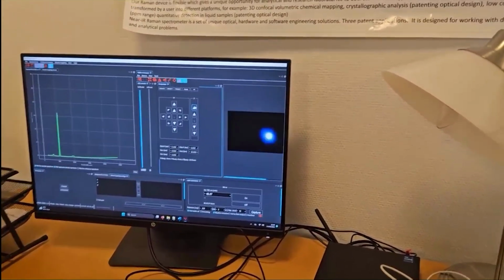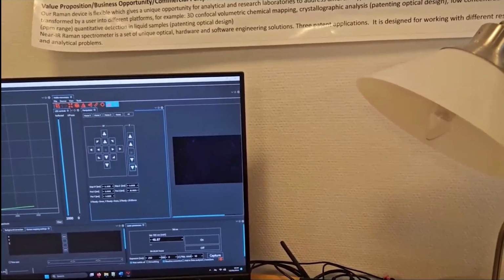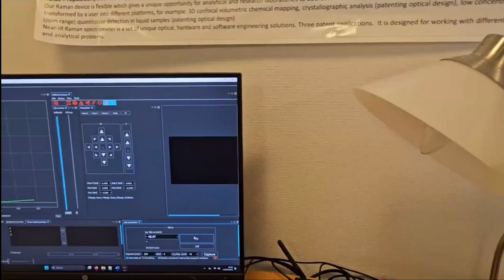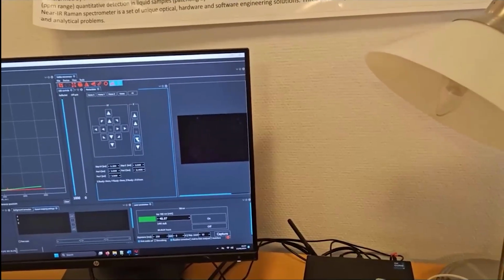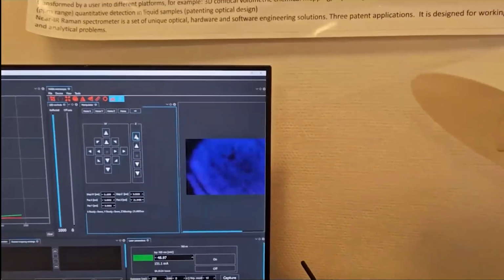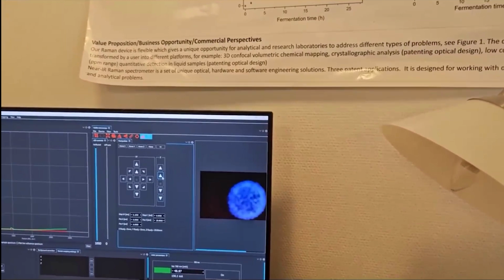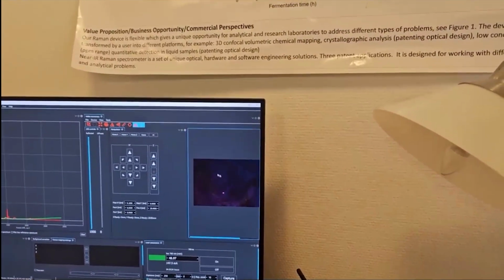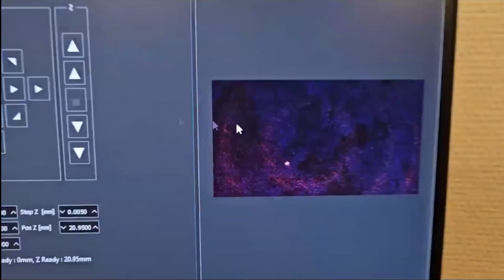Okay, now we have some light and the surface. The sample is transparent in this way. You see a dark image, not so much reflection from it. But let's see the laser spot. Well, the laser spot now is not in focus. We have to focus better. Yeah, here we are. There's some scattering, like these concentric rings. But what matters is the laser spot. That's where you measure.